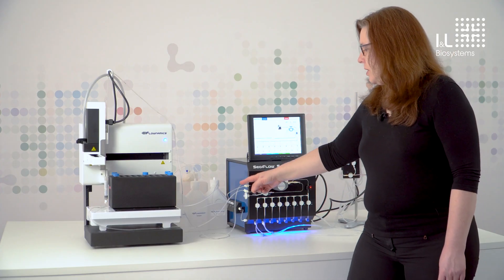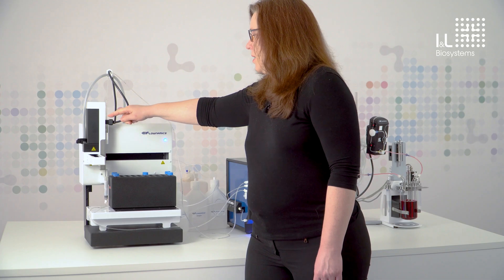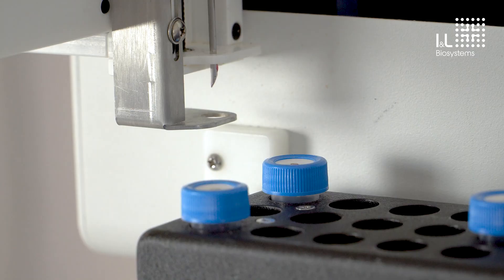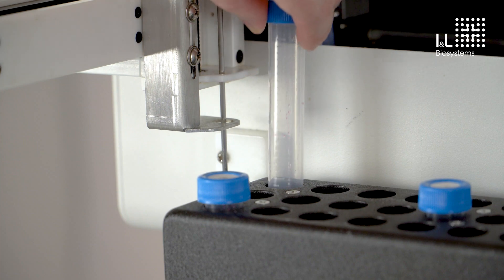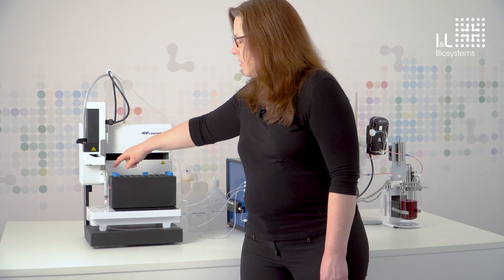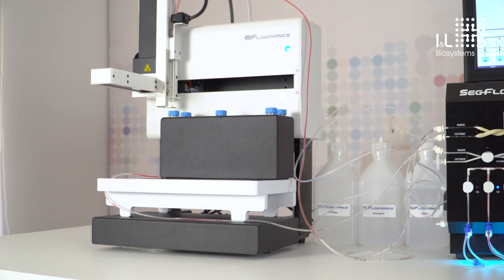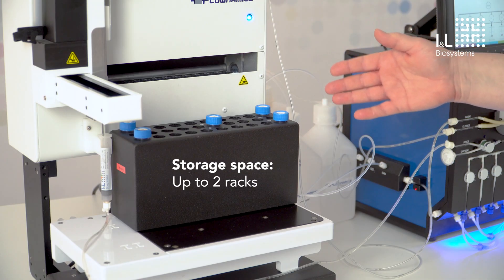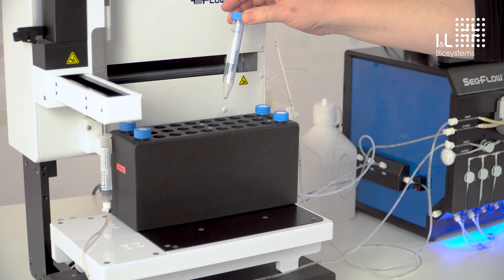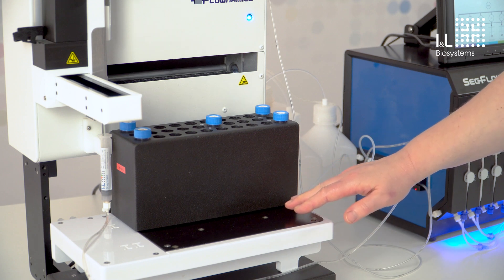The sample comes out and flows via this tube to the sensor. There it is recognized that the liquid has arrived. The sample needle moves over a free sampling vial such as the centrifuge tube, pierces through the septum, and then fills as much as has been previously set in the software. The needle then moves back to its home position and lets the sample drain into the waste bottle via the drainage pipe. The Flow Fraction Sample Collector has storage space for up to two racks. Here we see a rack with storage space for 30 positions for 15 ml centrifuge tubes. The racks are cooled from below using a cooling plate.